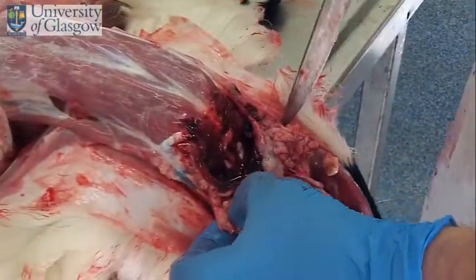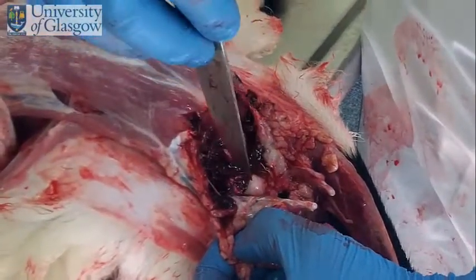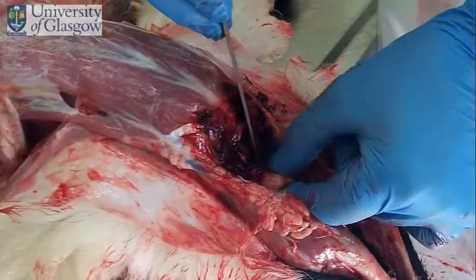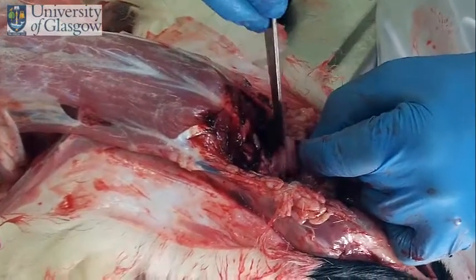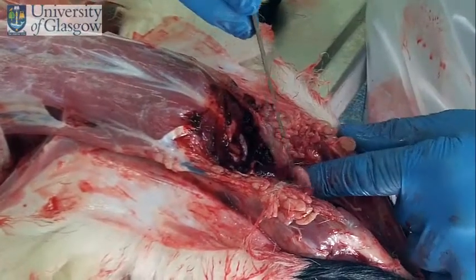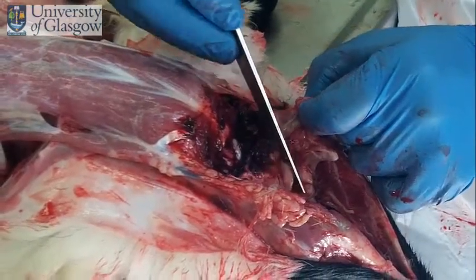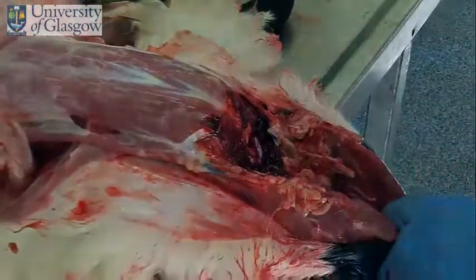At this point we want to have a look at our retropharyngeal lymph nodes. If I just do a little bit of dissection here, we can see the lymph node. I'll just lift it out — you can see it's quite a large node, you should be able to find it fairly easily. If we put an incision through it, you can see that it is slightly enlarged, slightly wet, and again an indicator that this is an animal not in great condition. Same on this side, and we can see the node here.